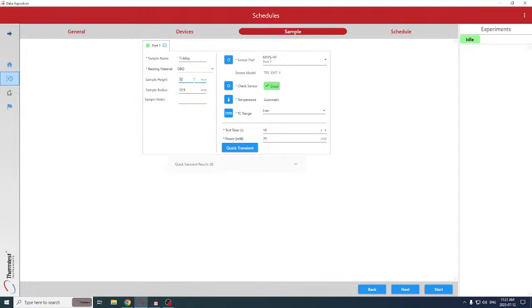Although it's a critical design element that we keep the ability to vary the parameters manually if you want to take a deeper dive or deeper understanding of your material. So both are possible. In the measurements that we've run, the iTPS is about a minute and a half measurement. We won't run it today. There's lots of demonstrations that show the iTPS run. The recommended parameters are 10 seconds and 25 milliwatts.